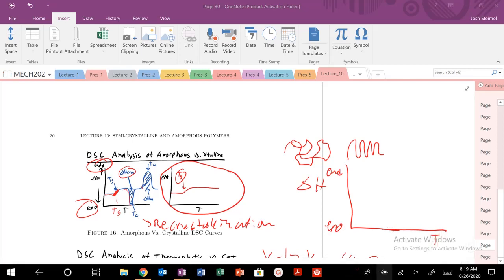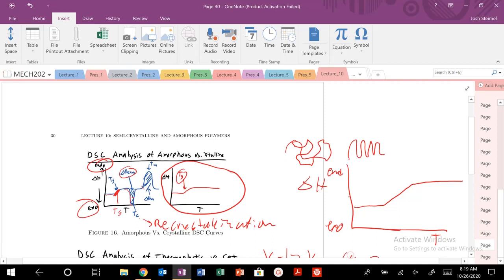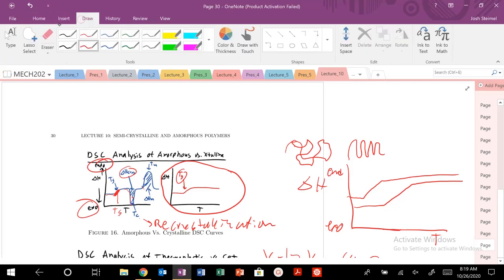What if I have a polymer like this? It's fully amorphous. Again, ignore the magnitudes there. I'm running the same exact polymer here, but for one run I get this Tg, and in another run I get this Tg. Usually you just find Tg at the center of this slope. So what can cause the difference here? Processing-wise, the polymer is exactly the same. So what can I do?